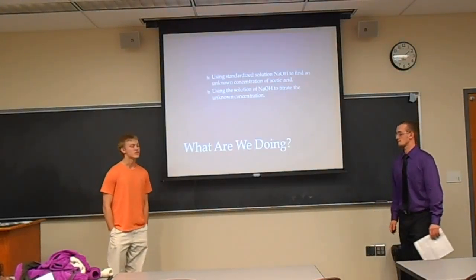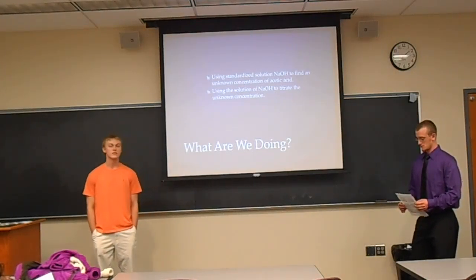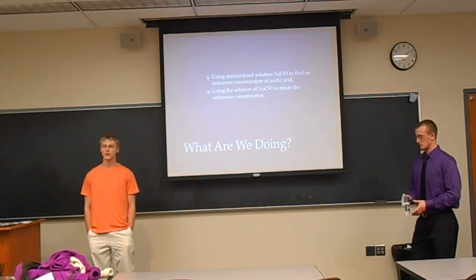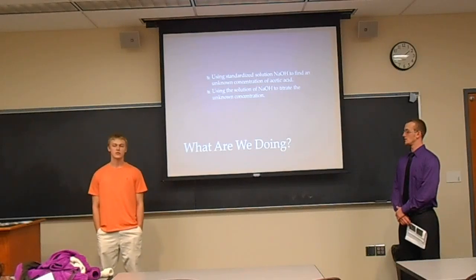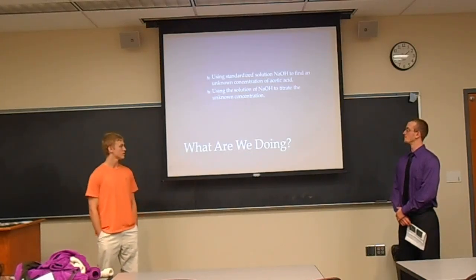Alright, and for the second part of our experiment, we were taking the standardized solution of the NaOH and finding an unknown concentration of acetic acid. We used this standardized solution of the NaOH in order to find the concentration.